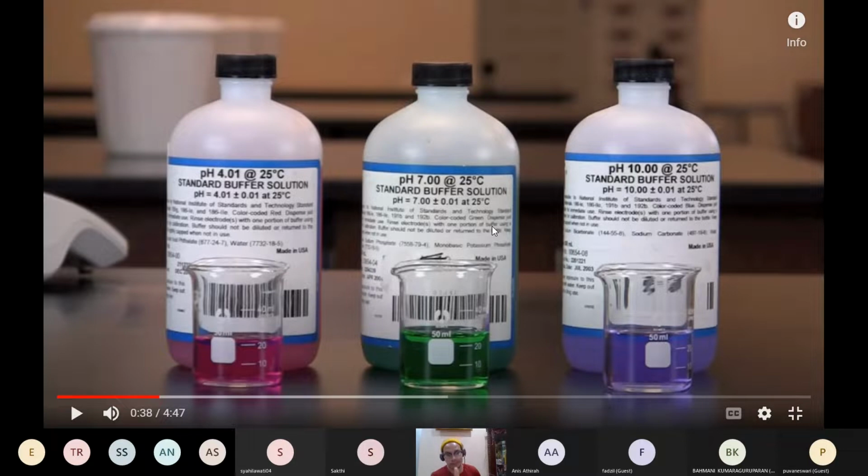Okay, so as you can see dalam on the label of the standard buffer solution, kita ada 3 different pH, pH 4, pH 7 and pH 10. So pH 4 is for testing the acidic condition, pH 7 is for neutral, pH 10 is for basic. So kita nak pastikan kita punya pH meter tu boleh detect this pH correctly.